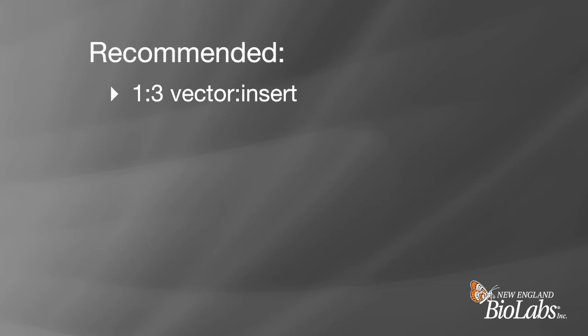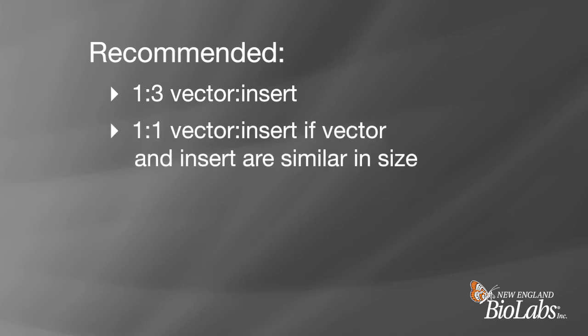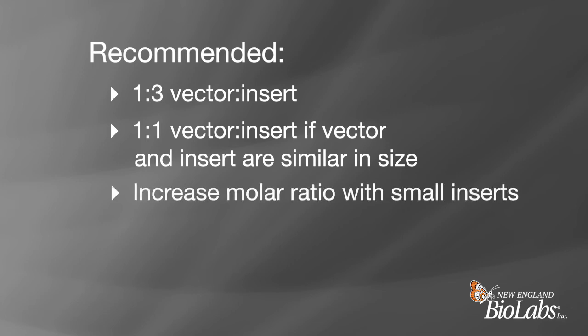If the size of the vector and insert are very similar, then a 1 to 1 ratio is the best place to start. As the size of the insert gets smaller in relation to the vector, then the molar ratio of the insert needs to be increased.